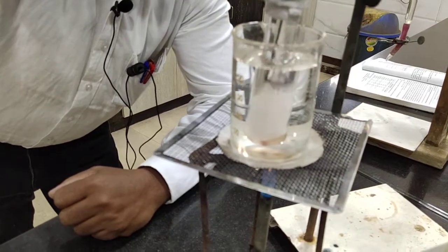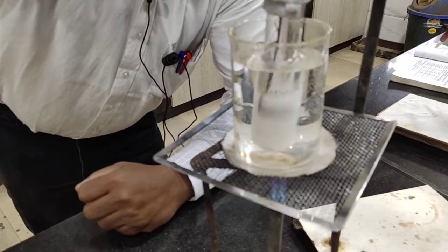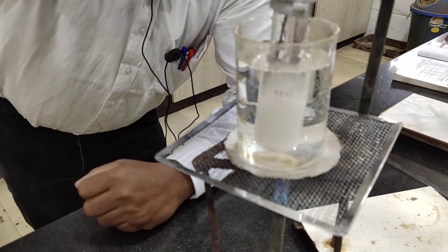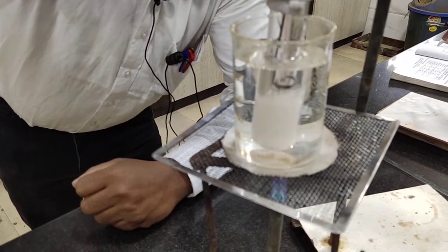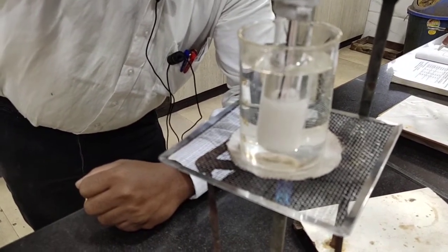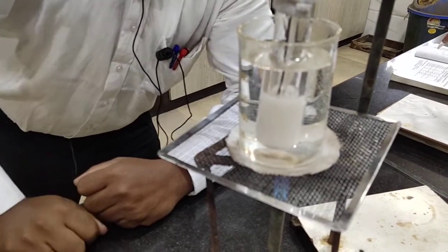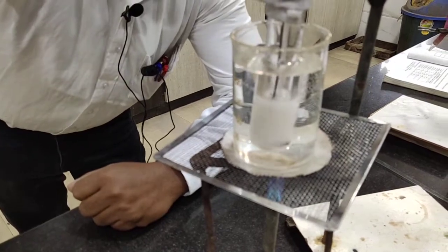Okay, now see here, the system becomes turbid. System becomes turbid means the two liquids are partially mixed in each other. When the solution becomes clear, we have to measure that temperature. So at what temperature it mixes, we have to see that temperature. So now the solution is clear.